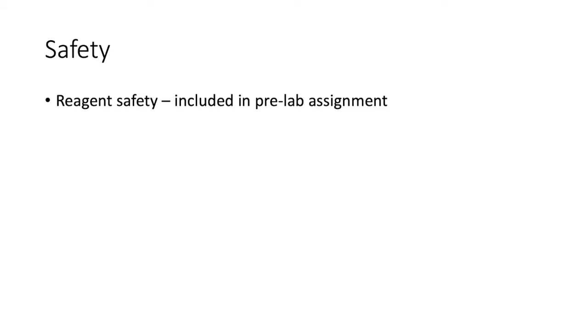Experiment 7 is all about testing the pH of different samples. In this experiment, you'll be getting practice in using pH indicator paper and pH meters, which are two very common methods for measuring pHs. In this experiment, we'll be using a number of different chemical reagents, many of which you probably have at home in one form or another.